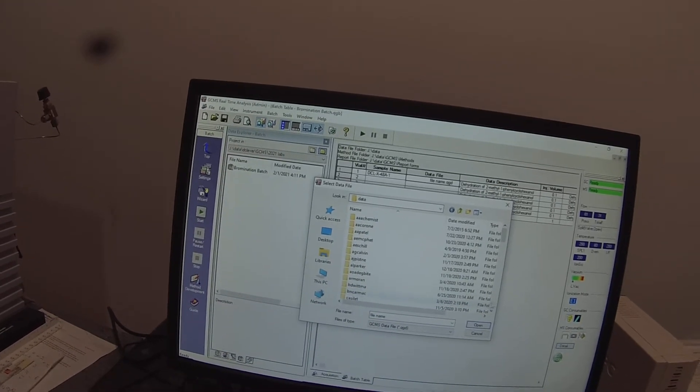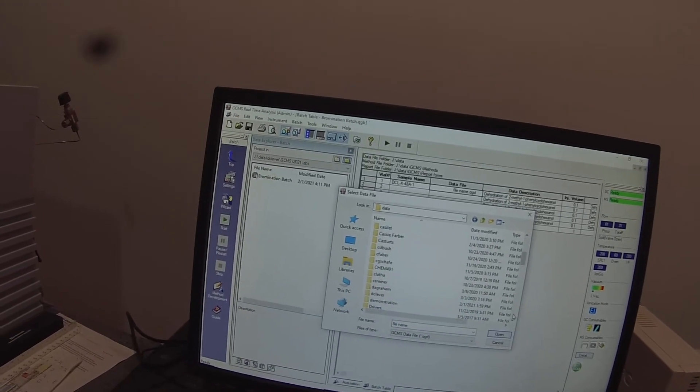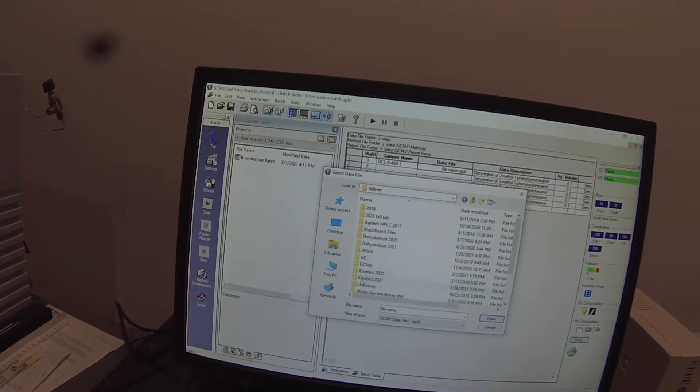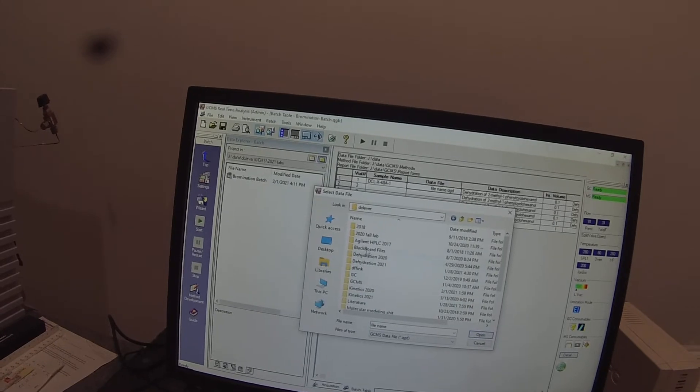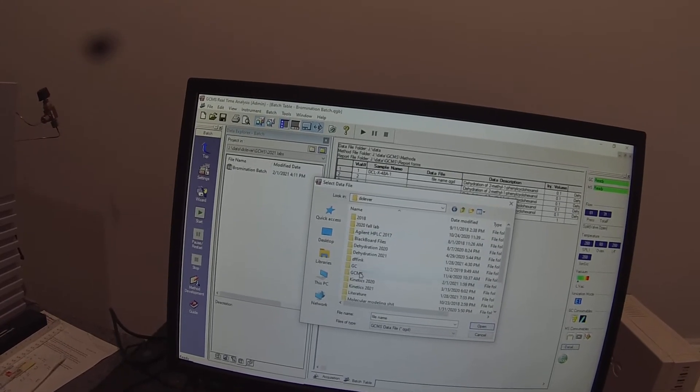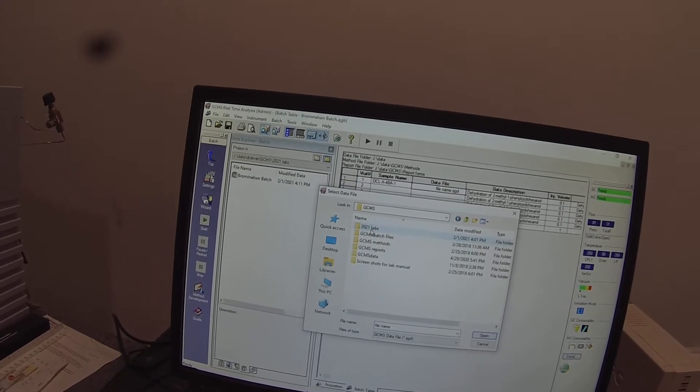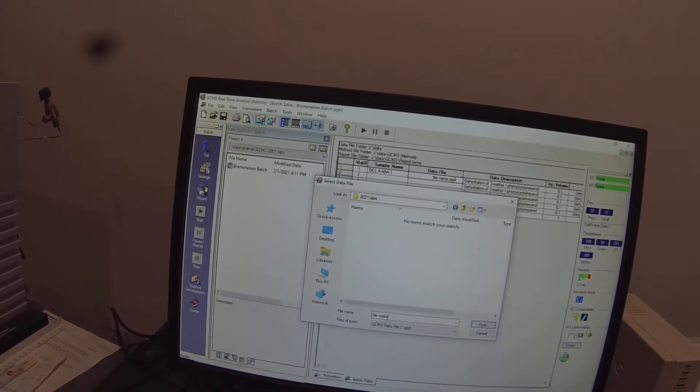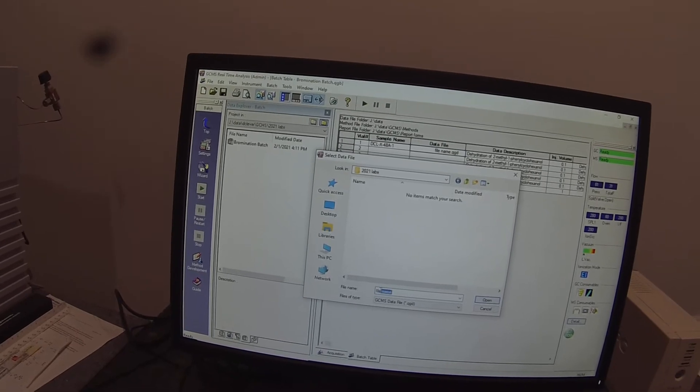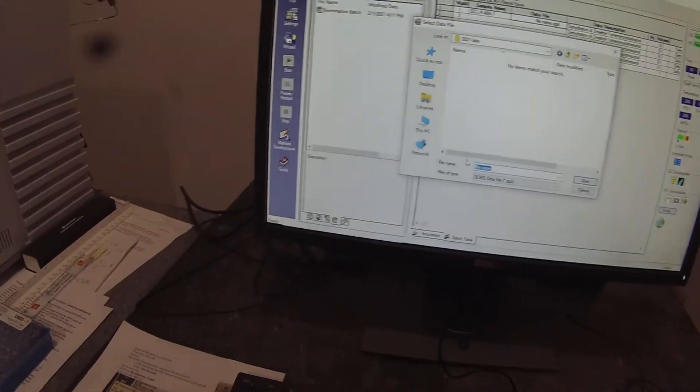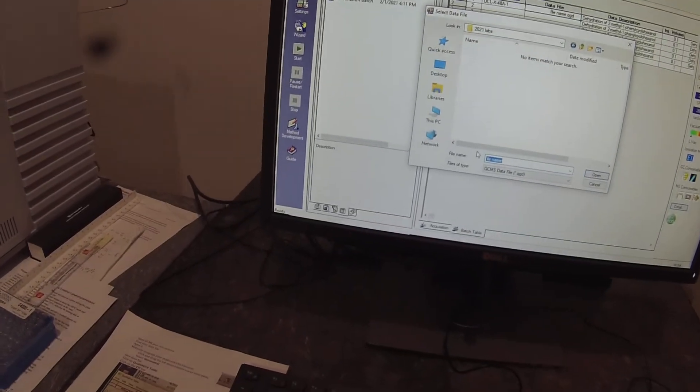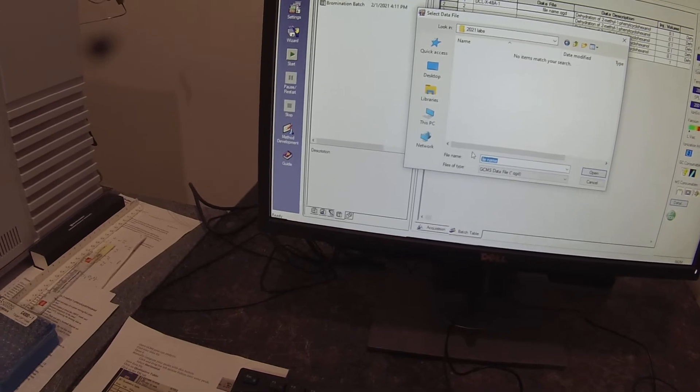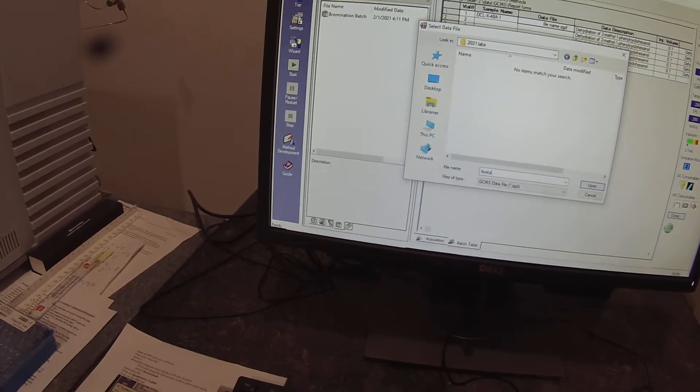So then I need to give it file names and I want to put them in the data folder in my folder. And I have under GC mass spec, a 2021 labs folder.